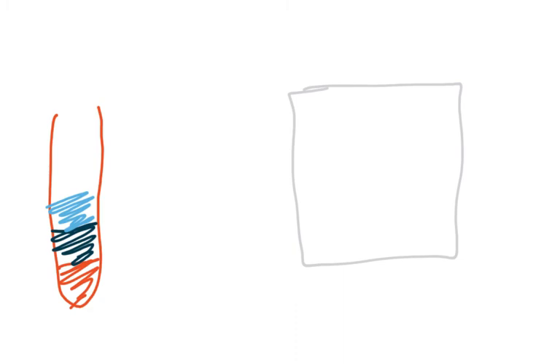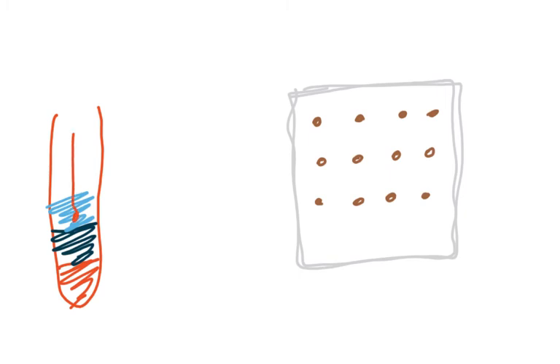Now what we will do is we'll do the same story, that we take a white tile and we add drops of iodine solution to it at spaced out intervals so that we don't want it to mix. And then what we will do is we will take a drop from here and then mix it with the iodine, and the color remains black.